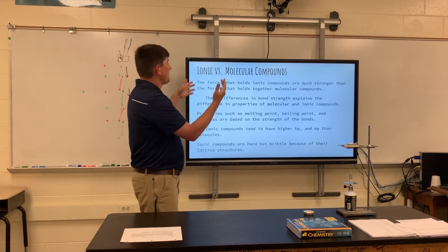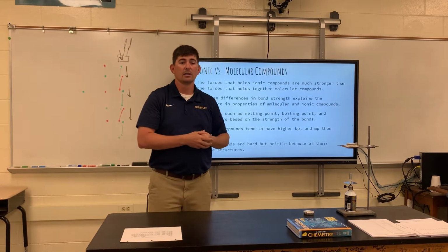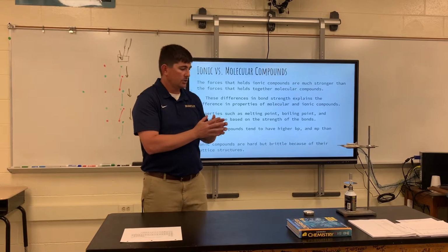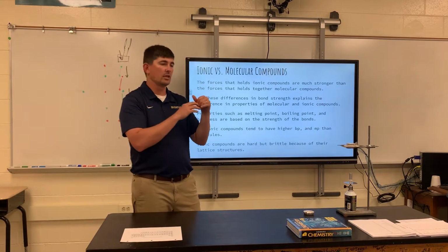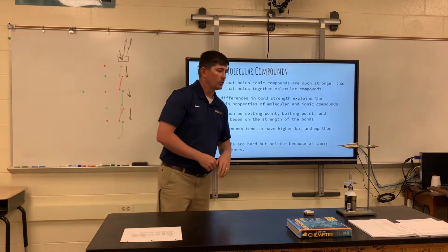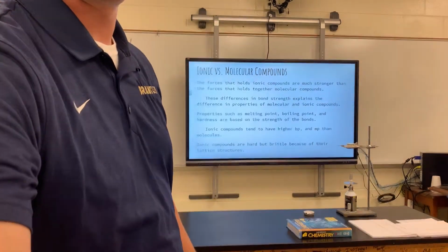Everything that we've learned about, everything that we talked about here, what you've read about in the textbook, what you read about in the packets, lends you to understand that ionic compounds tend to have higher melting points than molecular compounds. So we should see that in action here with what we did. Okay, so I'm going to grab the camera and we're going to come over here and let you look.